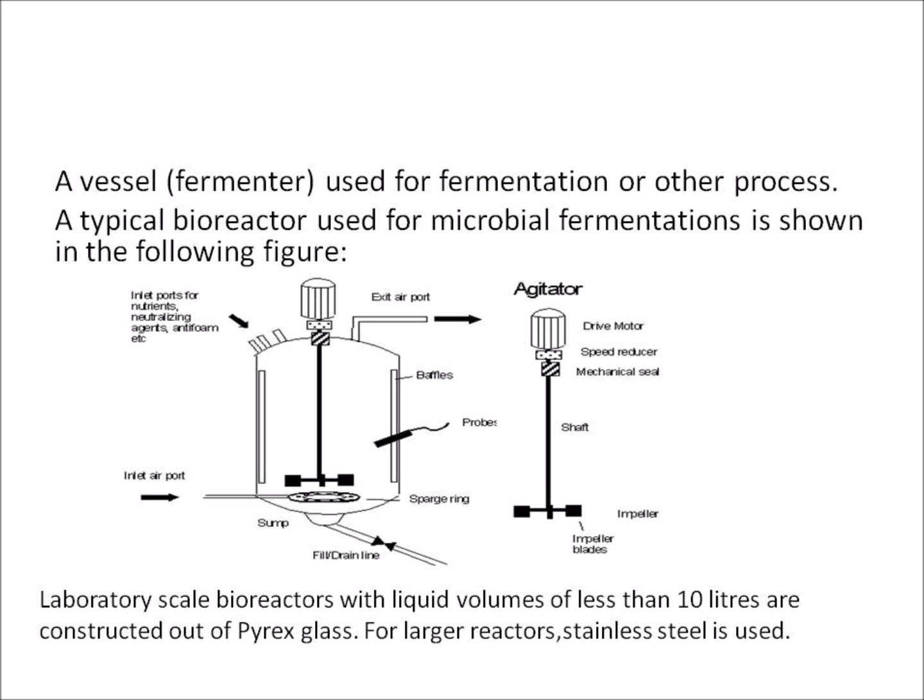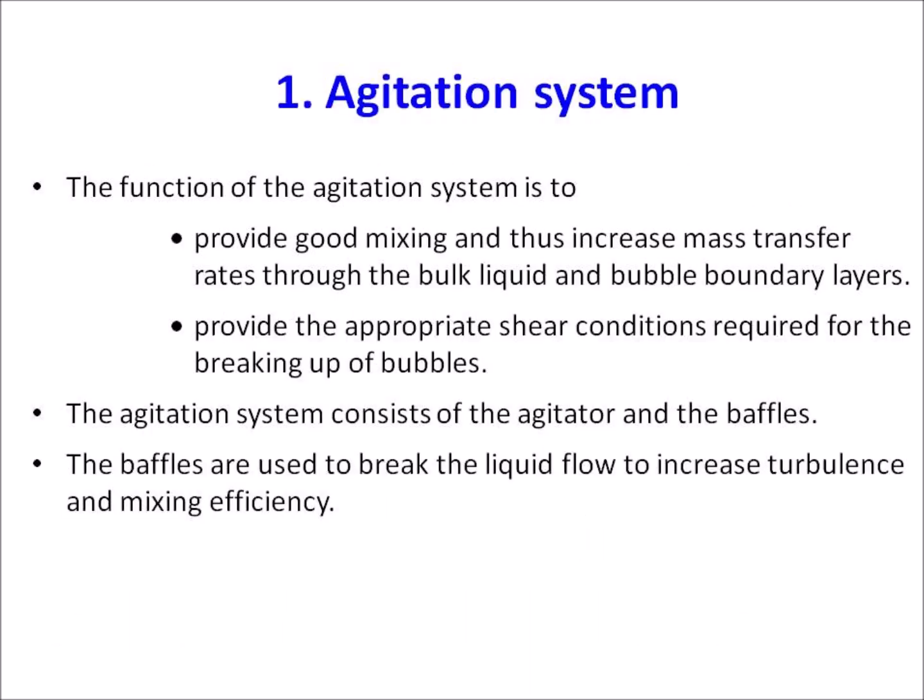A vessel used for fermentation or other process. A typical bioreactor used for microbial fermentation is shown in the following figure. Laboratory scale bioreactors with liquid volumes of less than 10 liter are constructed out of Pyrex glass. For larger reactors, stainless steel is used.